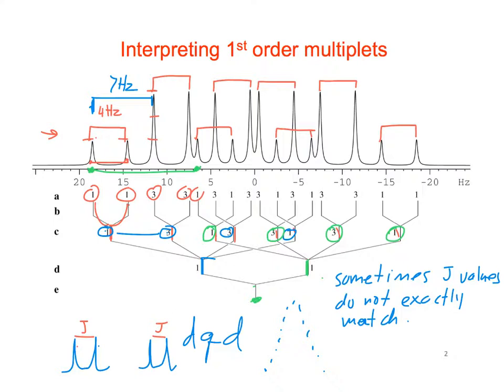And unless you have a data point that hits right at the very top of the peak, sometimes it'll go like this, and the top of the peak should be up here, but the way the data's been sampled, it kind of cuts across like this. There's just not enough data points to make the peak exactly right. And so the tip can be skewed just a little bit to the side.